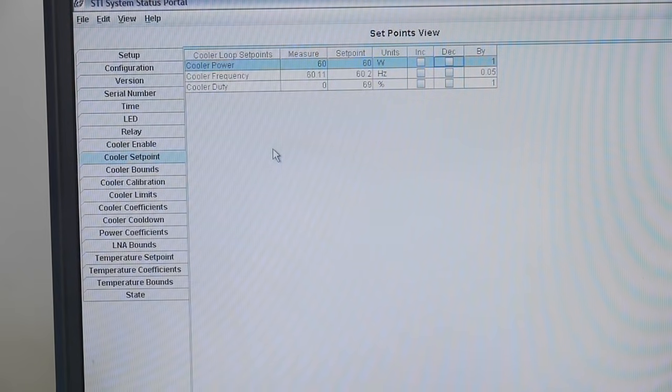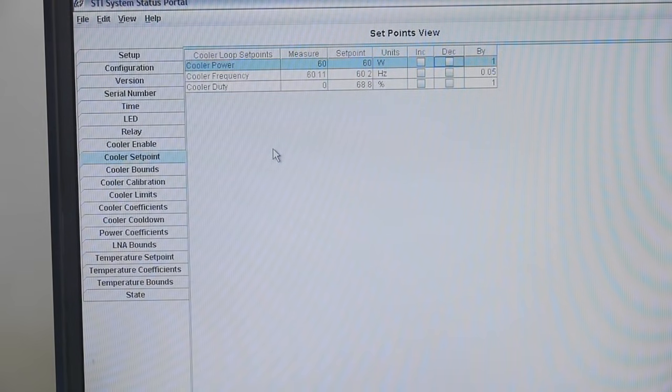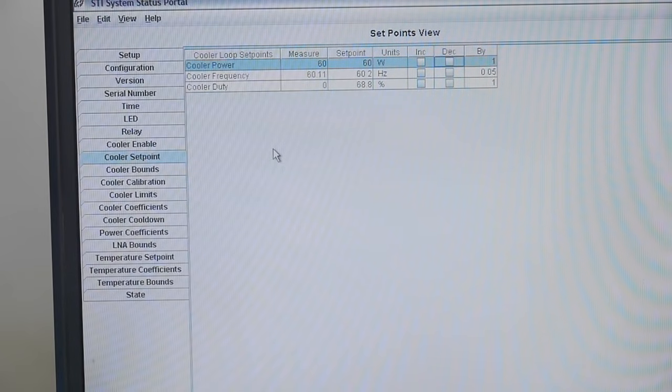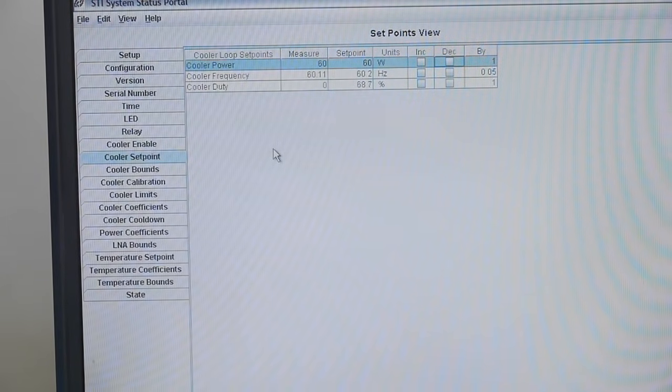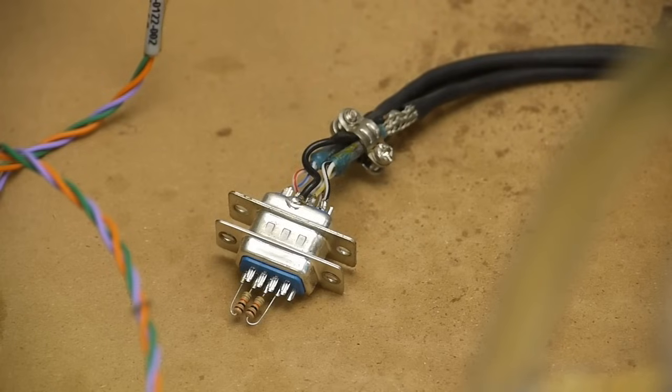Originally the device had temperature sensors on the cold end of the cryo cooler and it would use this information to figure out how much power it could pump in without breaking the cryo cooler. As I mentioned it can't go to full power right away when the device is warm. Unfortunately the temperature sensors broke. They're very difficult to remove and I had them off and then they were working and then they broke but anyway so I've replaced the temperature sensors with fixed resistors and now I just edit the power settings manually.